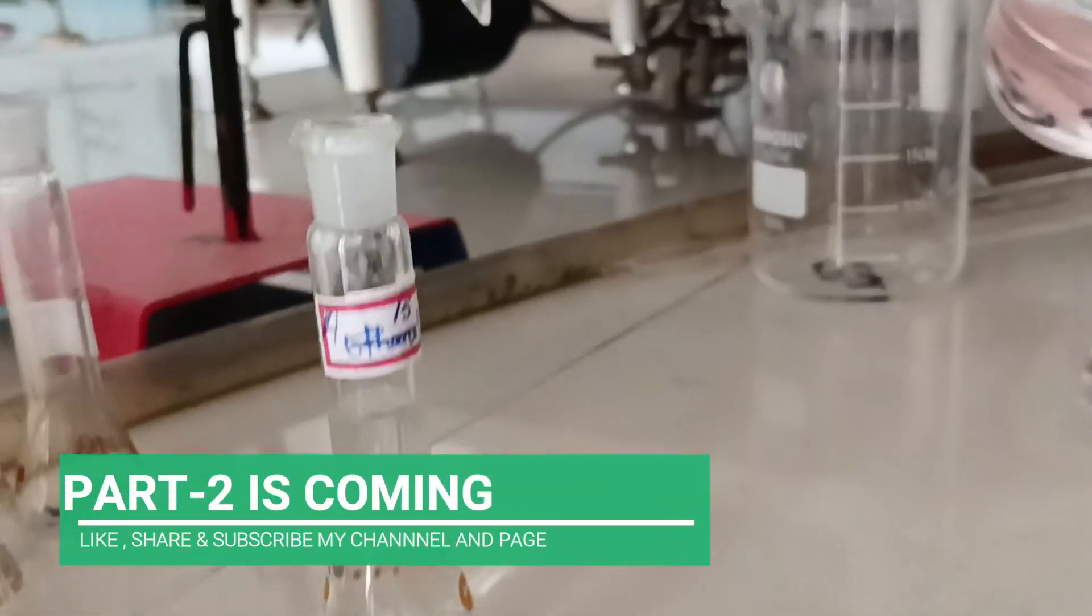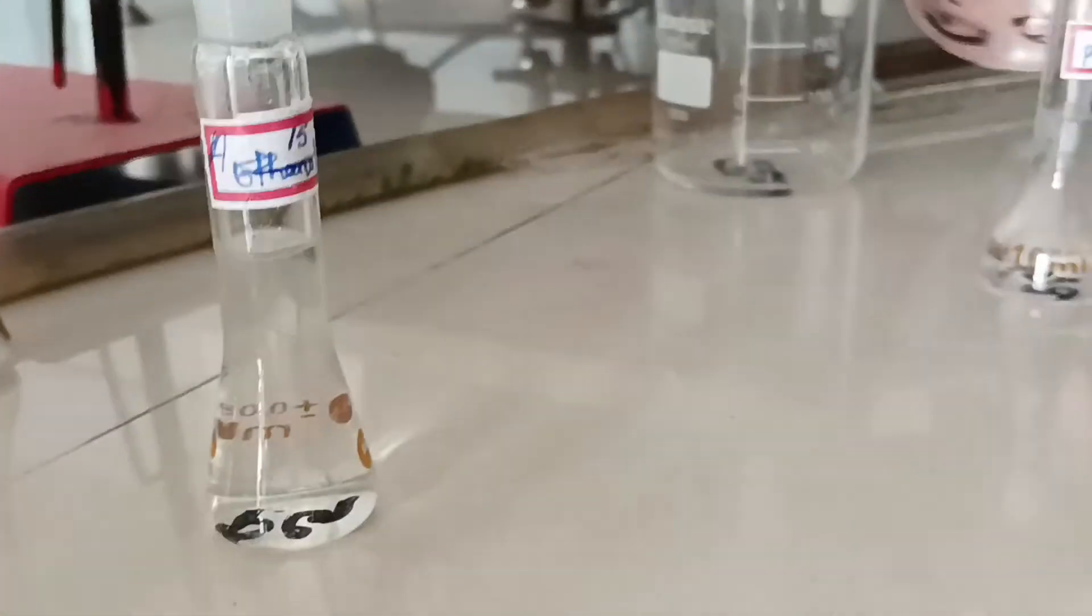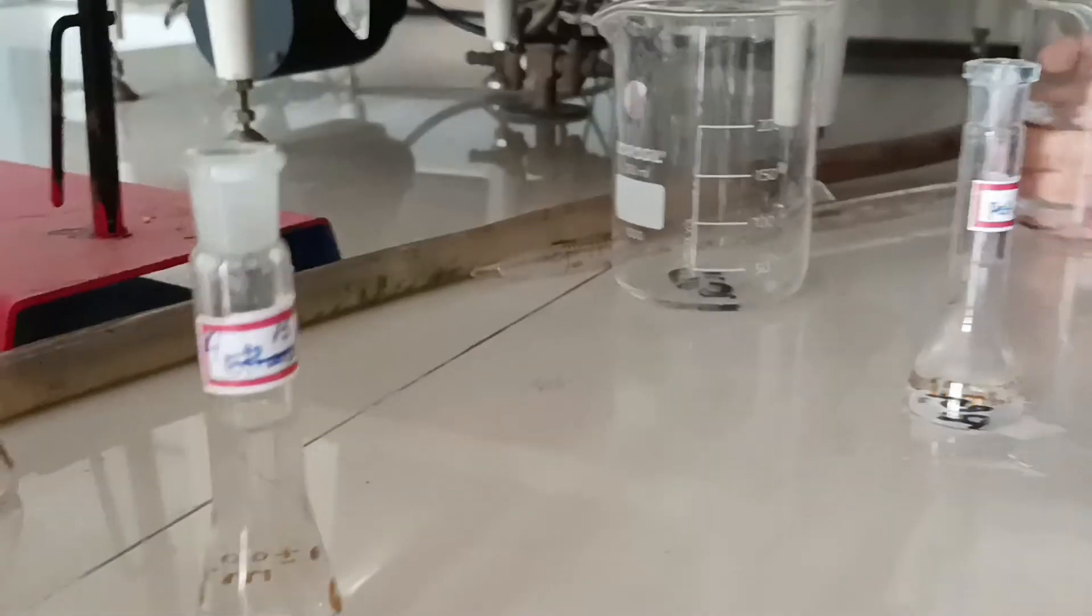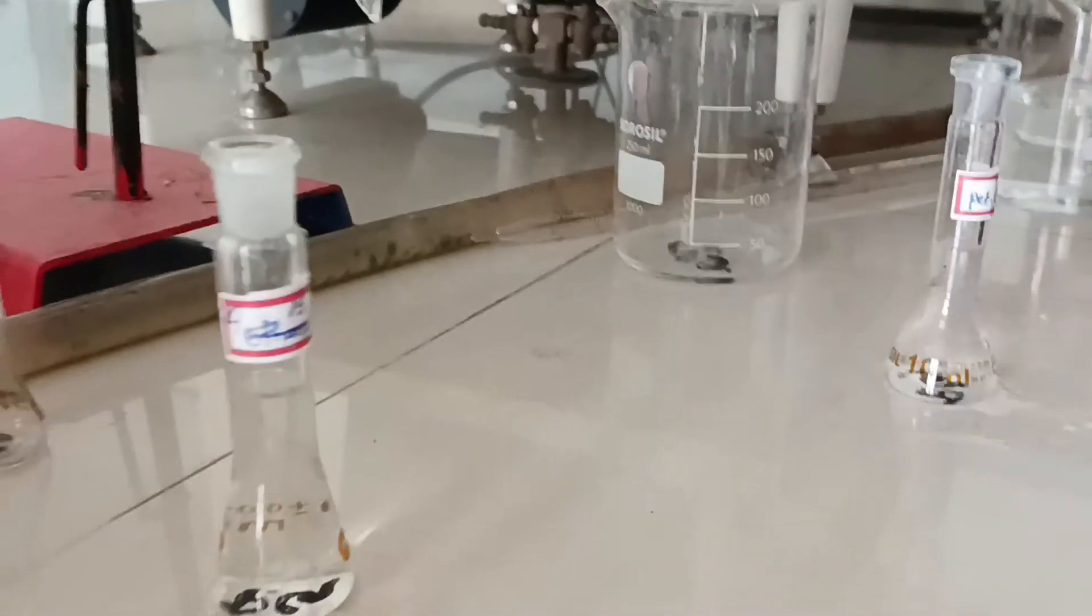Now after this, you have to take these samples to the UV spectroscopy and do the analysis. I will show you in the next part.